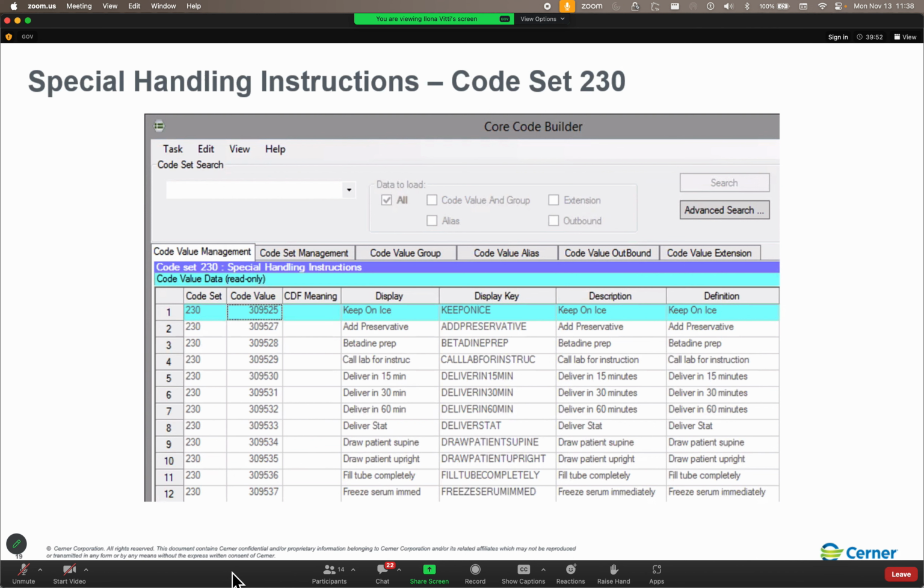All right. Now I do want to point out in the notes under slide 23, it will tell you why this add option is dithered. And it's dithered because we have back here on the middle screen only include specimen types already associated. We want to be able to add a new specimen type, we have to uncheck that box.